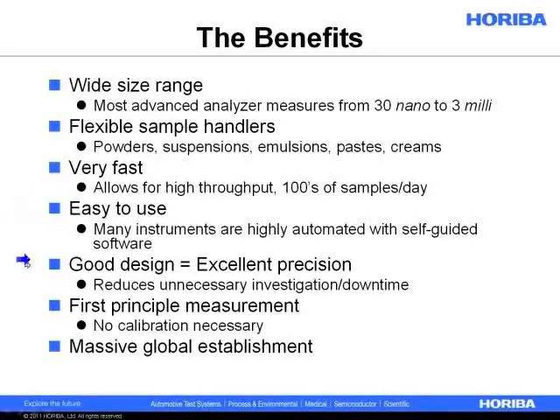If the instrument is well designed, it should have very, very good precision. And really why precision matters is that it reduces unnecessary downtime. If you have multiple instruments or multiple operators or even multiple labs, you want to make sure that the same material produces basically the same answer. And that's really what I mean by precision here.